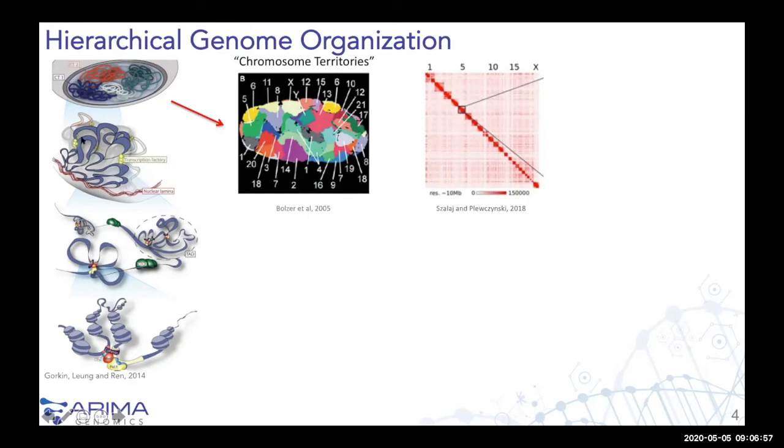And if you zoom in maybe a little bit further, you see other structural features like parts of the genome or chromosomes tending to associate with the nuclear lamina and other parts of the chromosomes extending more towards the nuclear interior. You see the presence of transcription factories and other puncta that are structurally significant features of genome organization. If you zoom in further on the scale, let's say of one chromosome looking at 1 megabase sort of units, you see these self-interacting chromatin domains here that might be called topological domains, TADs, contact domains. There's a few different terms for them that are somewhat used interchangeably.